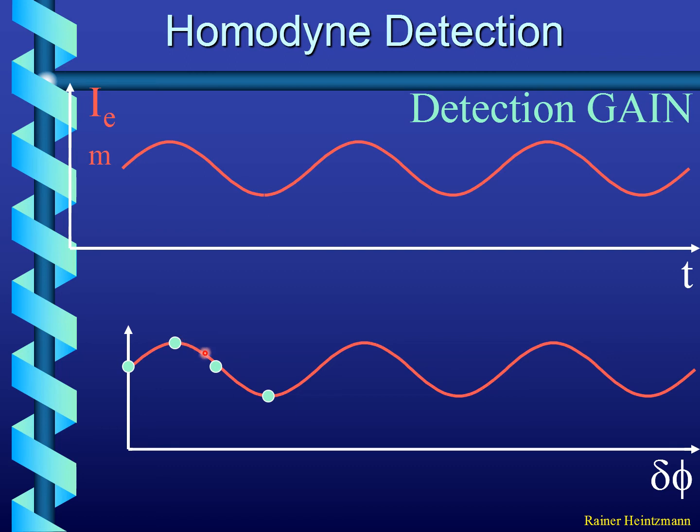But you therefore get this curve, and from this curve you can determine two things. One thing is called the relative phase shift between the excitation phase and the maximum of your homodyne detected signal. And this is related via this equation here to what is called the phase fluorescence lifetime, so tau phase.